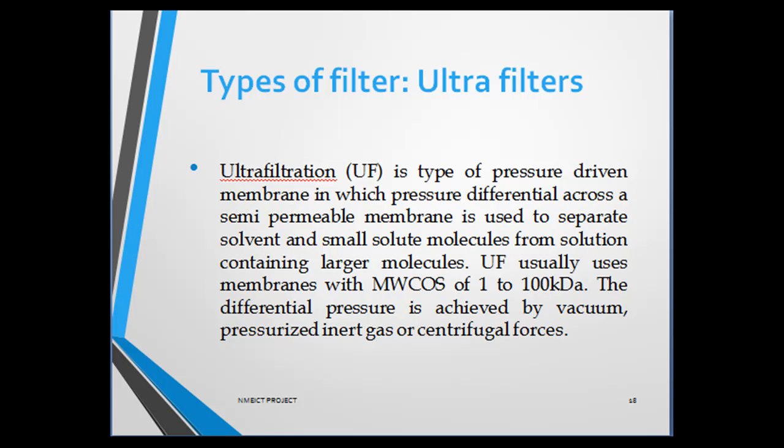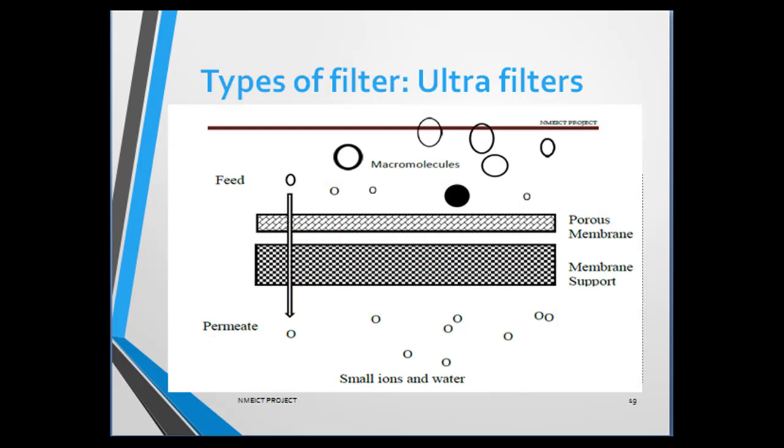Molecular cutoff value is the size of the smallest particle that cannot penetrate the membrane. Molecular cutoff values are not absolute because the degree to which a particular solute is retained by an ultrafiltration membrane does not entirely depend on its molecular weight. It is also dependent on the shape of the solute and its association with water, and its charge also affects its permeability through an ultrafiltration membrane.